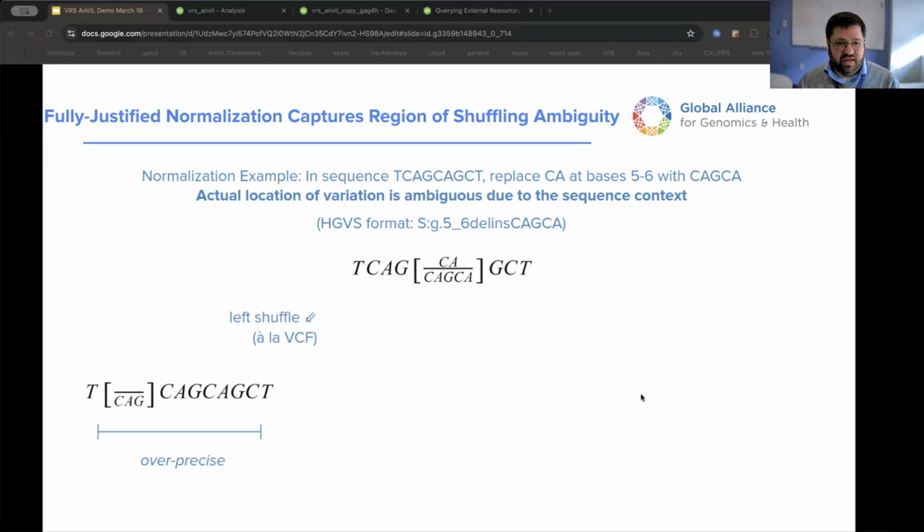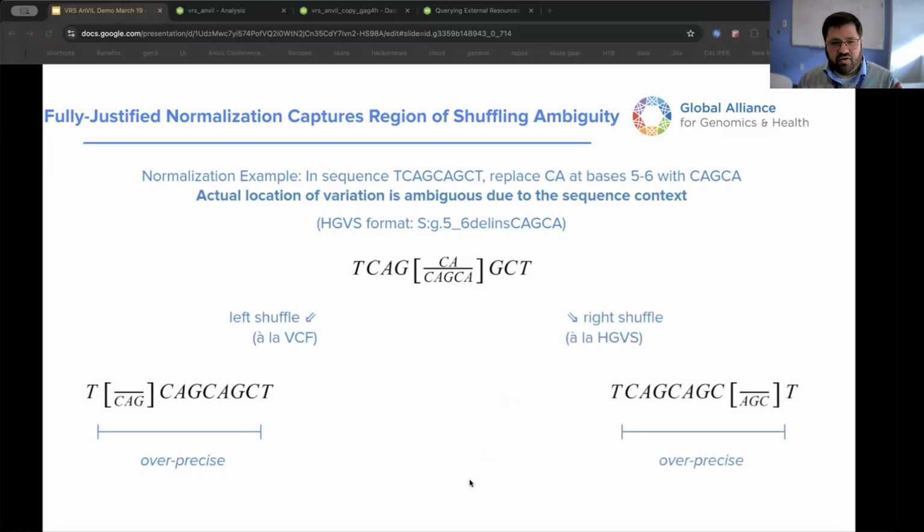And then if you're dealing with HGVS, we see that this gets added all the way to the 3' end. And I say 3' because it's actually like 3' or C terminus, but the idea being that it's always at the end of the sequence, which may or may not actually align with the corresponding genomic orientation. But in essence, they always put it at the other end. So it might not, and often doesn't, overlap with the VCF representation of the same variant.